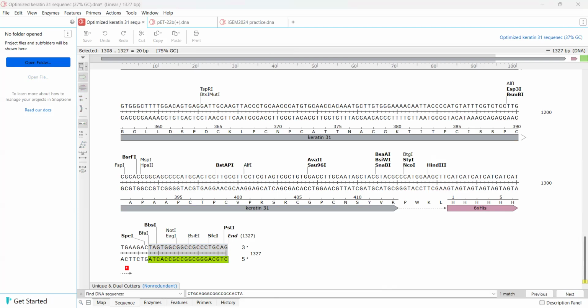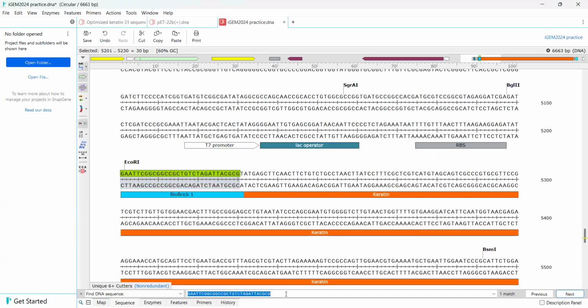These are only primer, not only, but this goes into the TM. But let's see where the Gibson extensions are. Same as what we did with the previous one, we'll copy this primer into the newly designed plasmid to see where the extensions start. Extensions should now start here. This is the forward extension, so there will be no reverse complement this time. It will be for the next primer. Let's try with 40 base pairs.